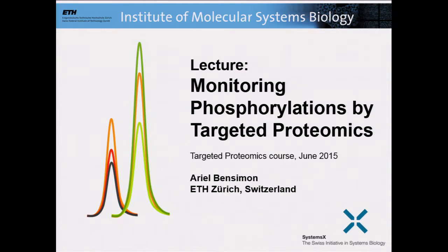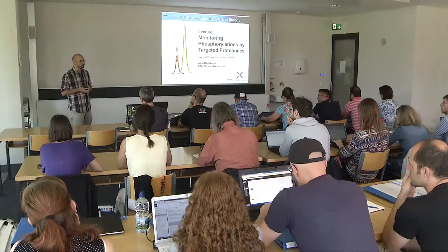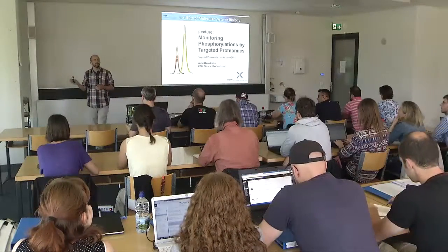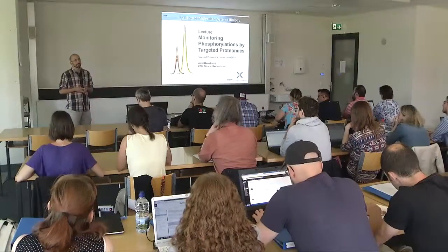So in this talk, we're going to talk about phosphorylations in specific. Everything I will say is generalizable to many other PTMs. I'm going to be reflecting on some things that we've learned throughout the course, highlighting some things that are a bit different when we're looking at PTMs.